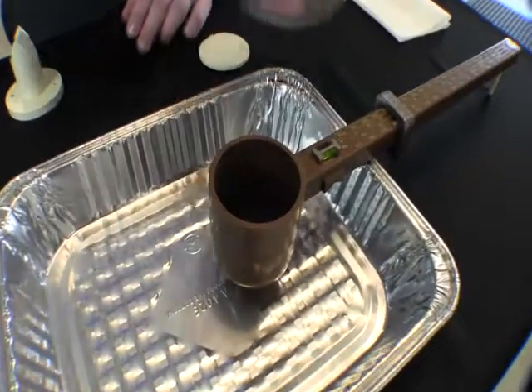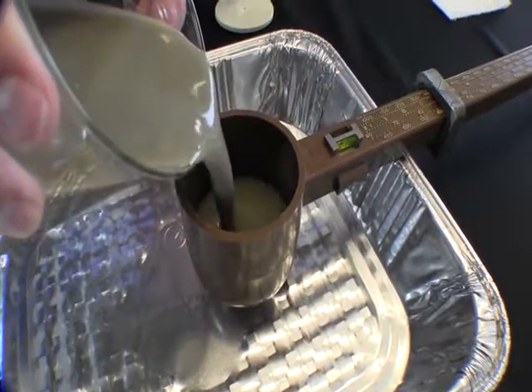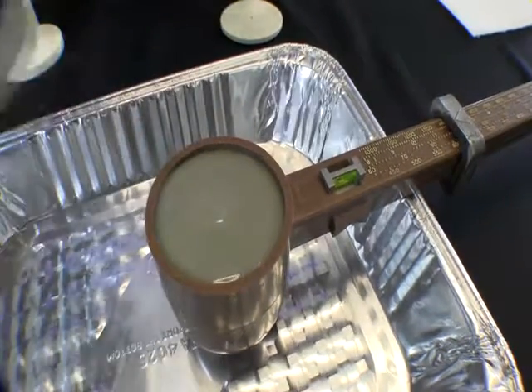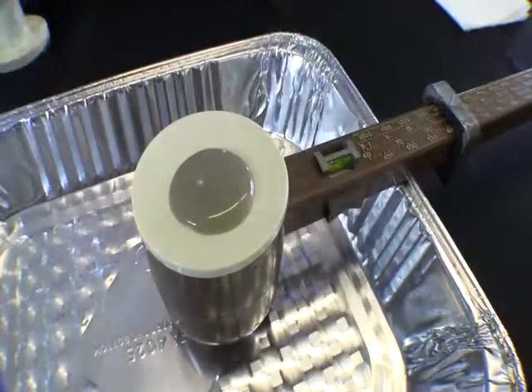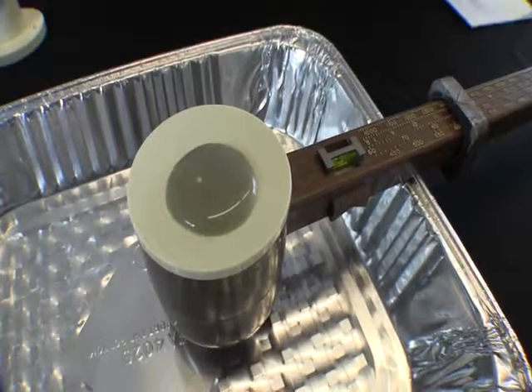Step one in the density test is to fill the cup of the mud balance full of your bentonite drilling fluid. It is important to fill it all the way to the top. Next, the lid is placed on the top of the cup. It is important to have bentonite drilling fluid come out of the top hole. This ensures that the cup is completely full.